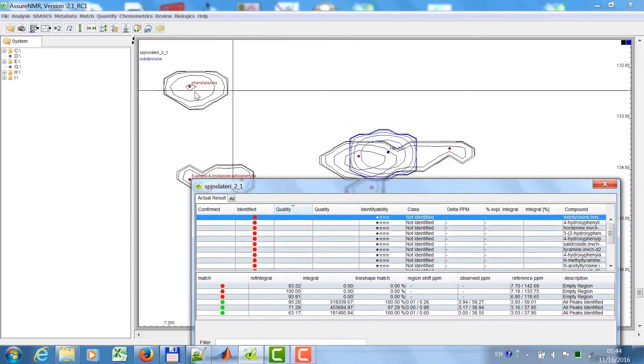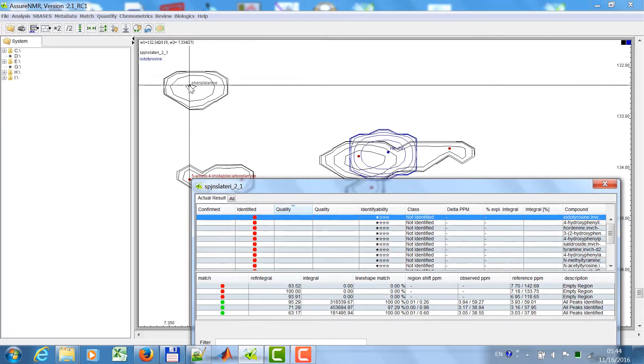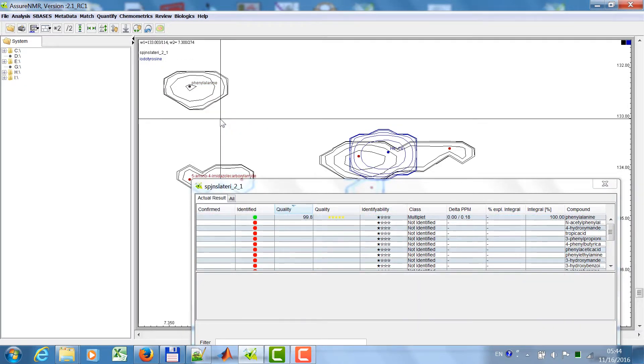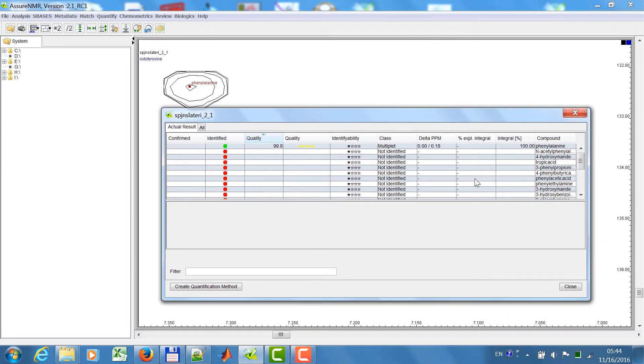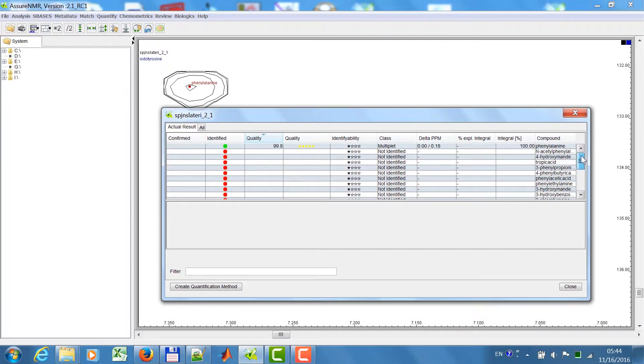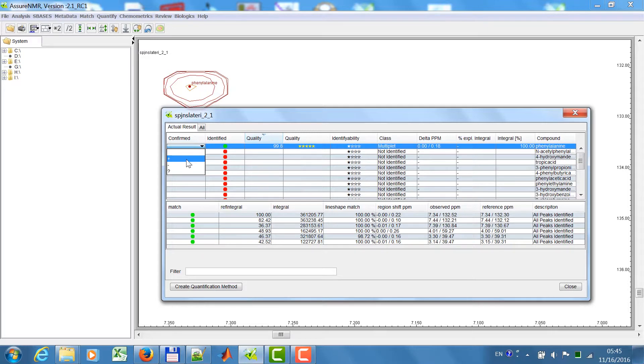If you go now to another peak, phenylalanine, right mouse click, identify this peak, then you will see also all compounds that have intensity in this area. If you are satisfied with this, then you are able to say, okay, I want to confirm, yes, that this compound is really there.